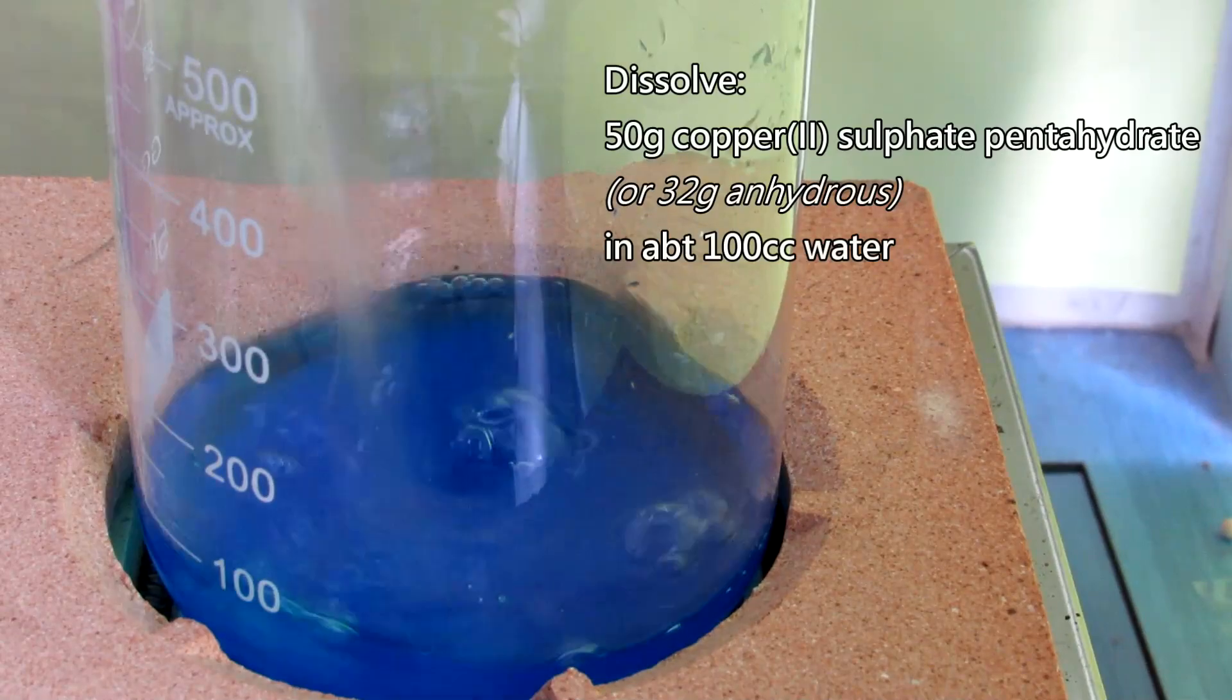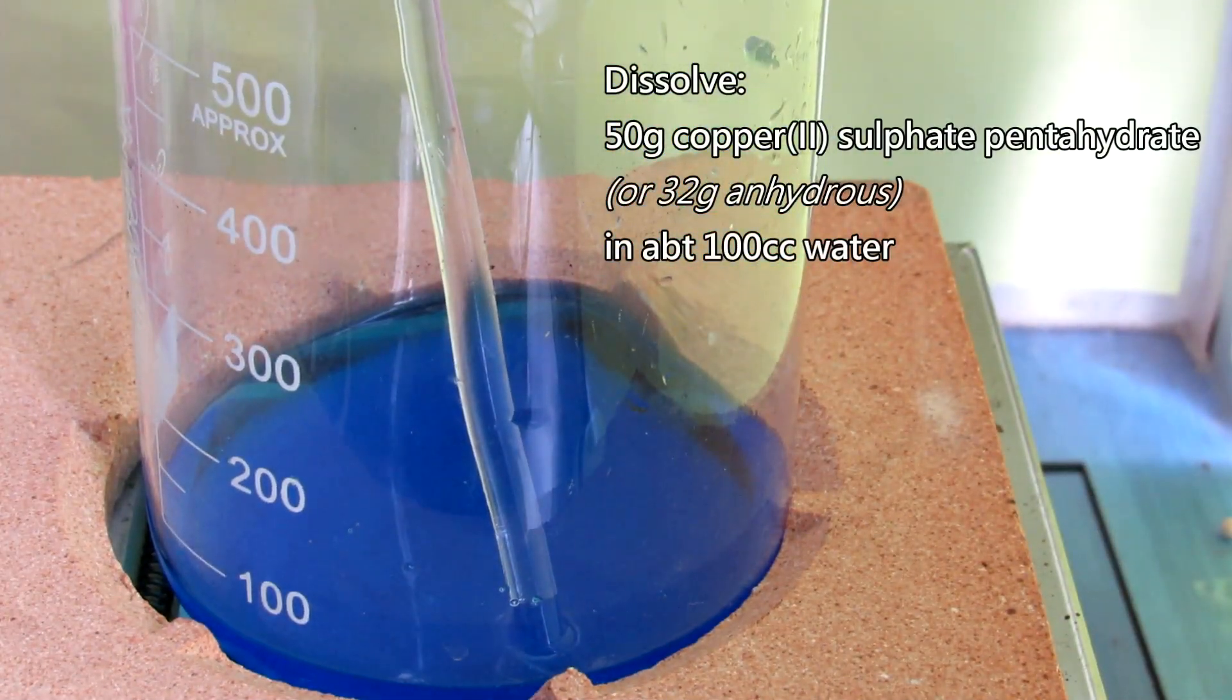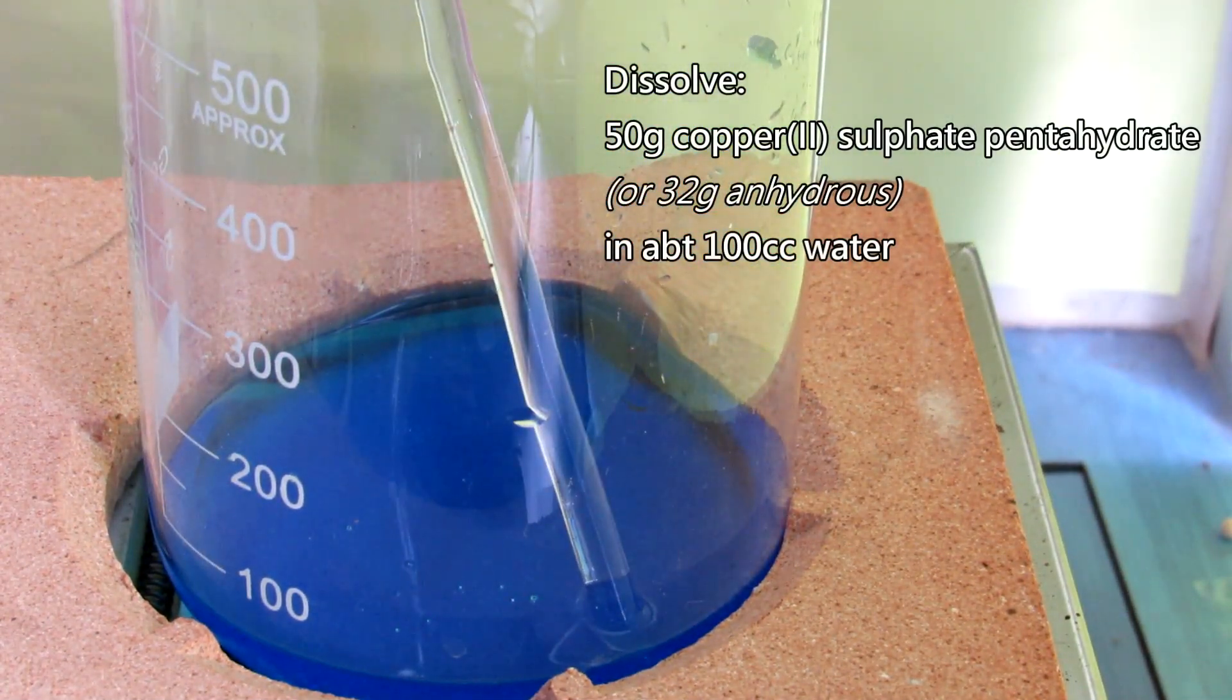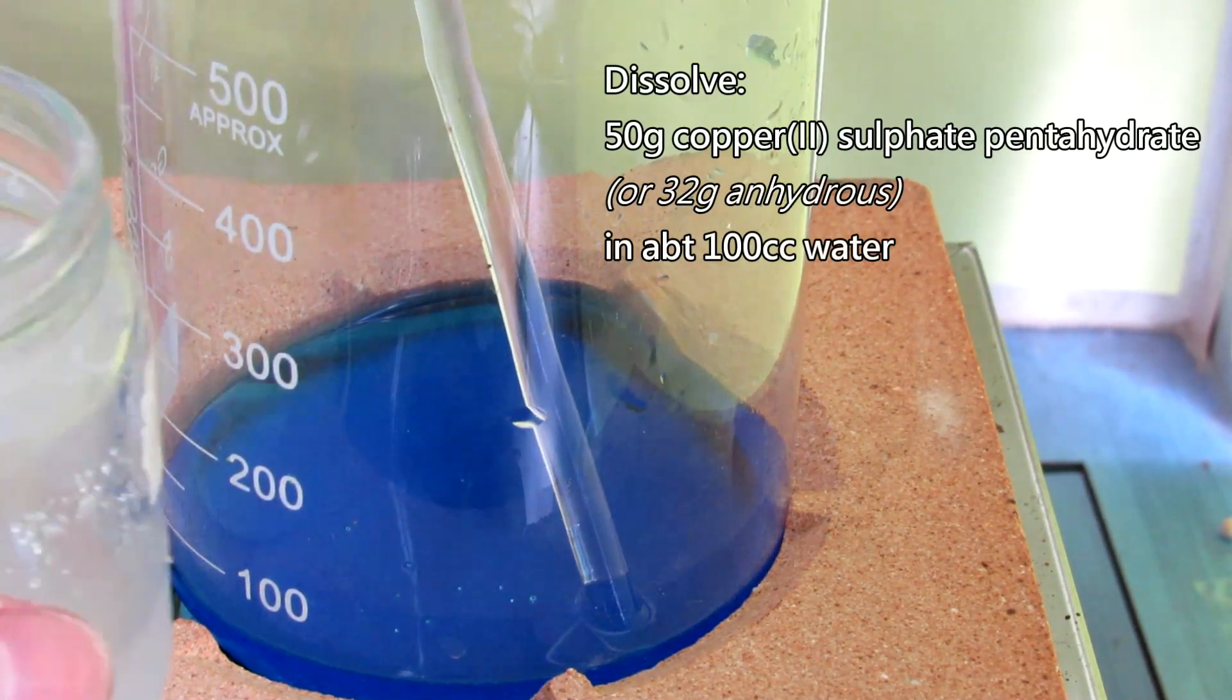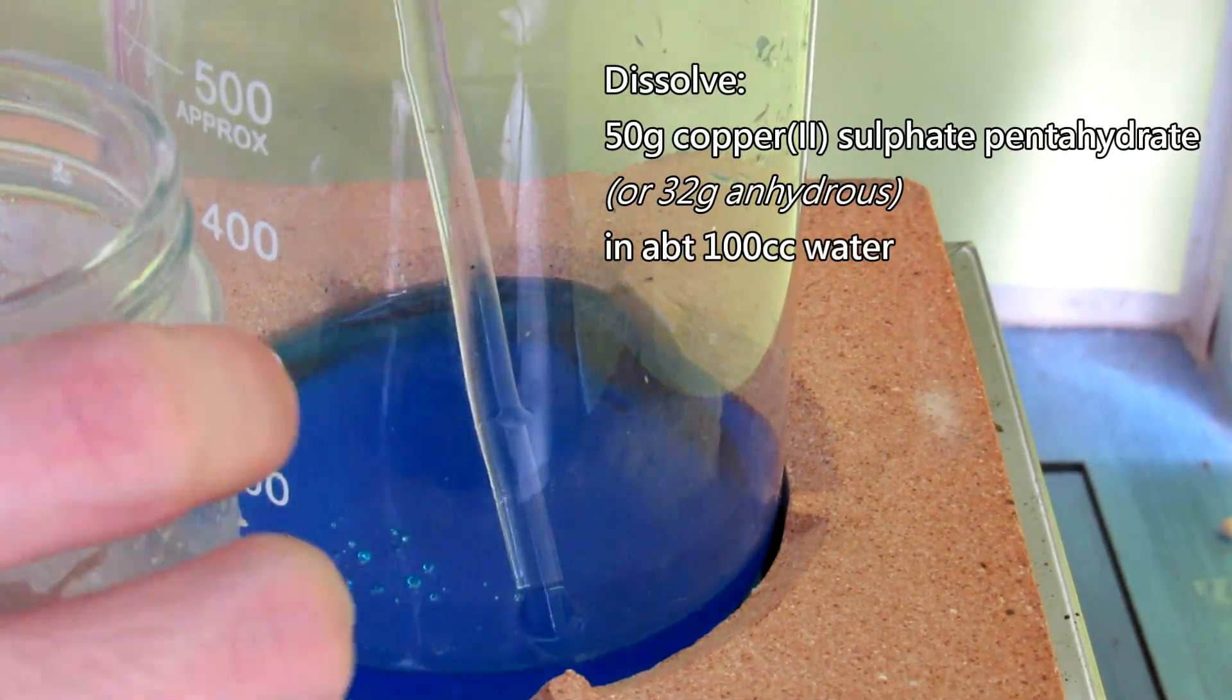First, dissolve 50 grams of copper-2-sulfate in roughly 100 cc of water. I heated and stirred the solution to speed up the dissolution.